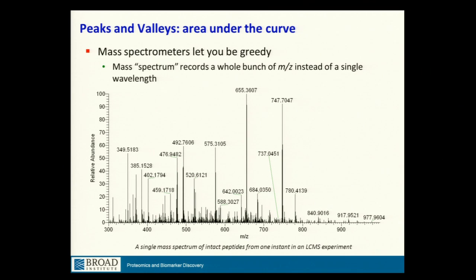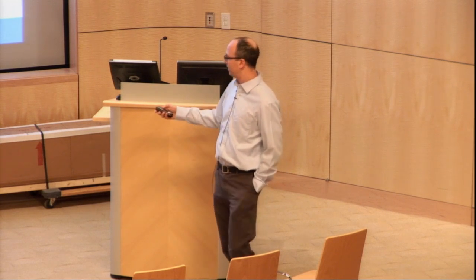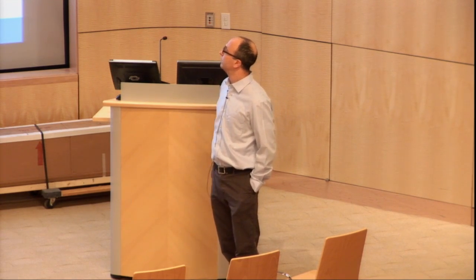And so this is just a single mass spectrum of now intact peptides from a typical LC experiment. Now we have to figure out how we can quantify all the stuff that's in here as the experiment evolves. So what can we do?